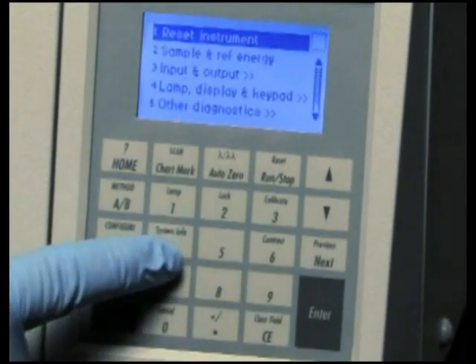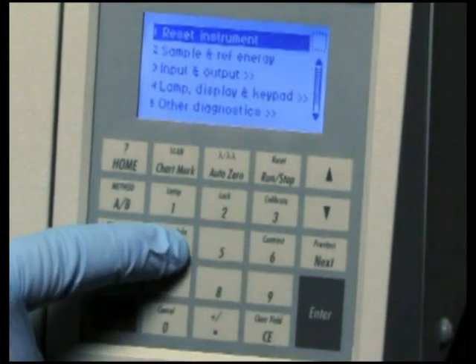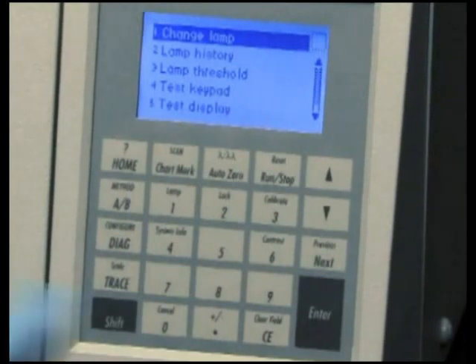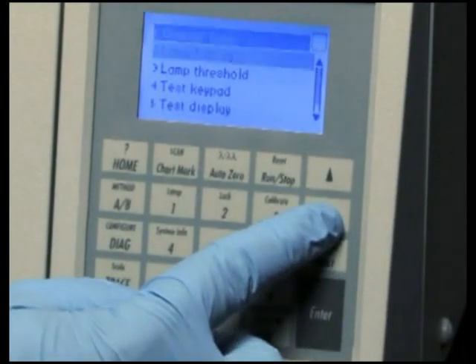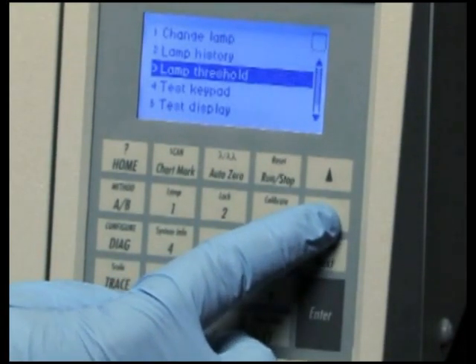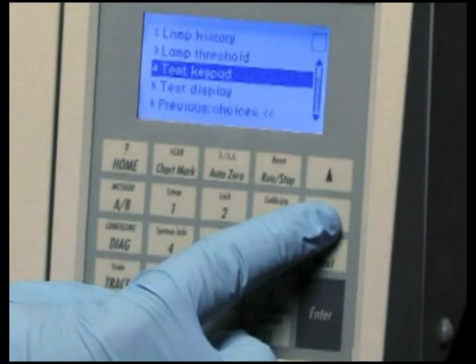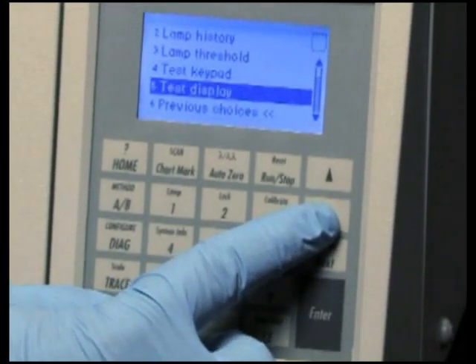Selecting Lamp, Display and Keypad accesses a list of diagnostics used to change the lamp, test the keypad, and test the display functions.